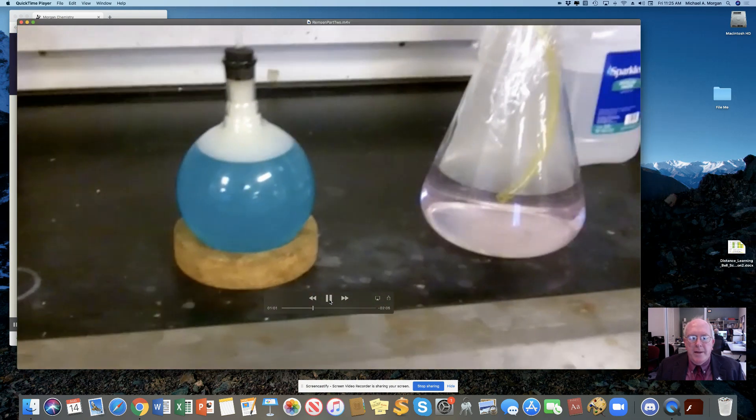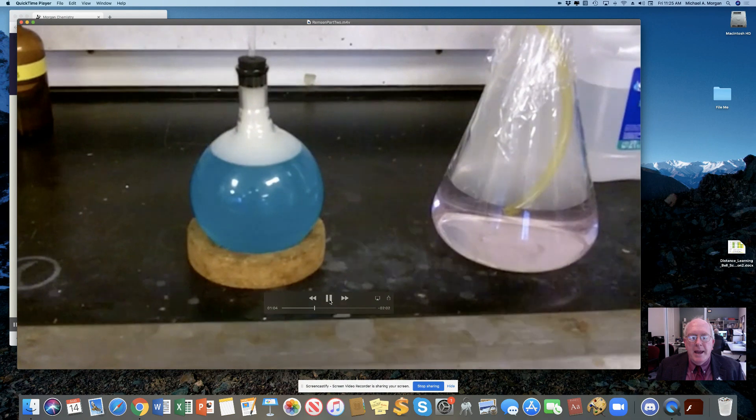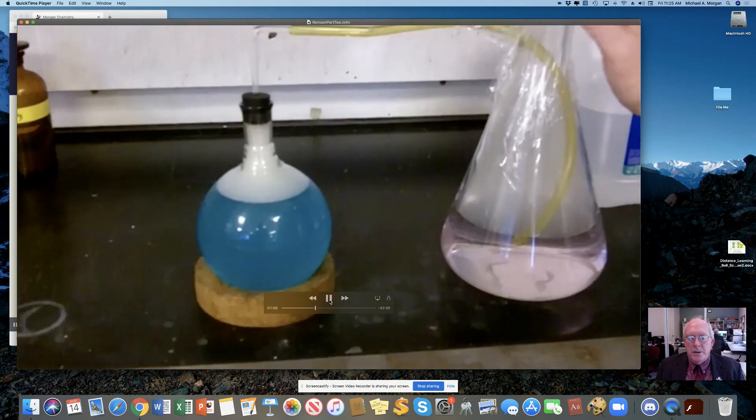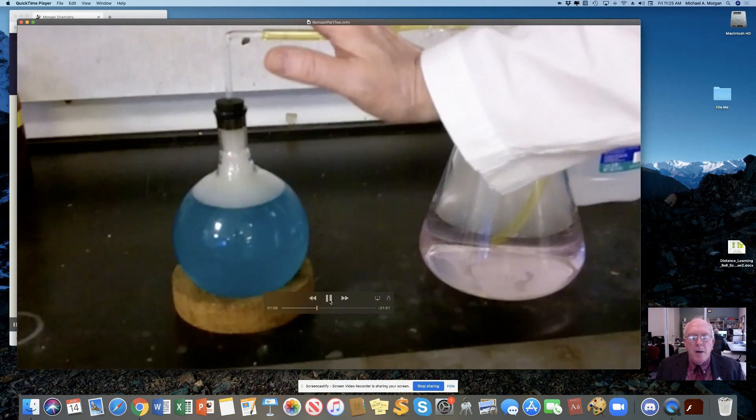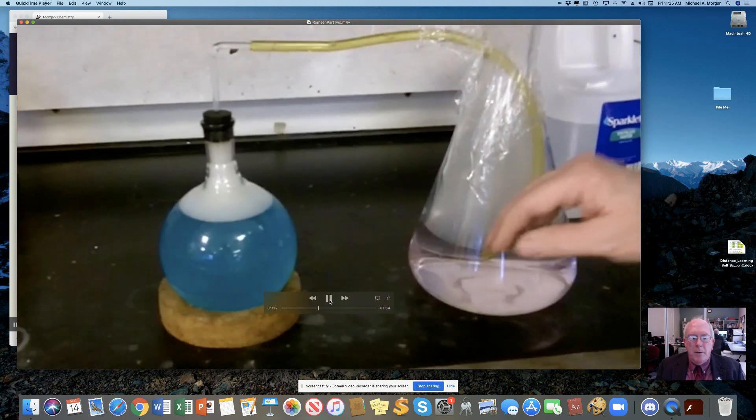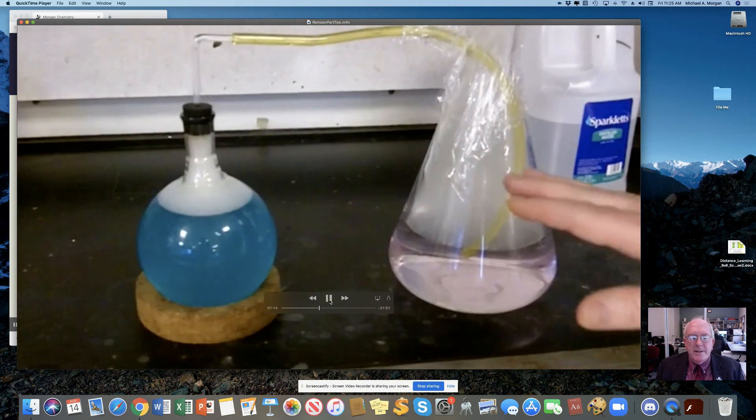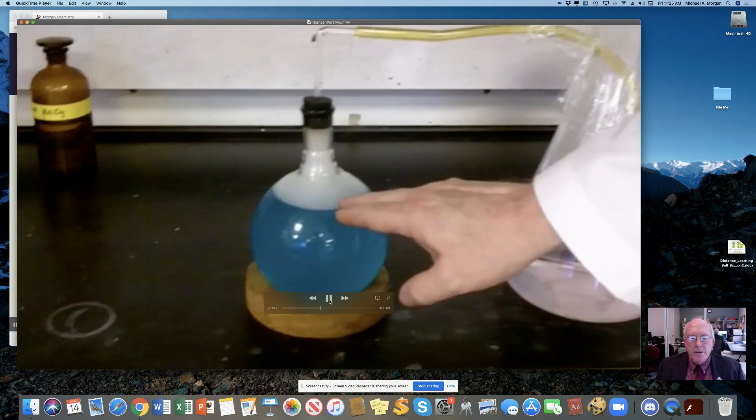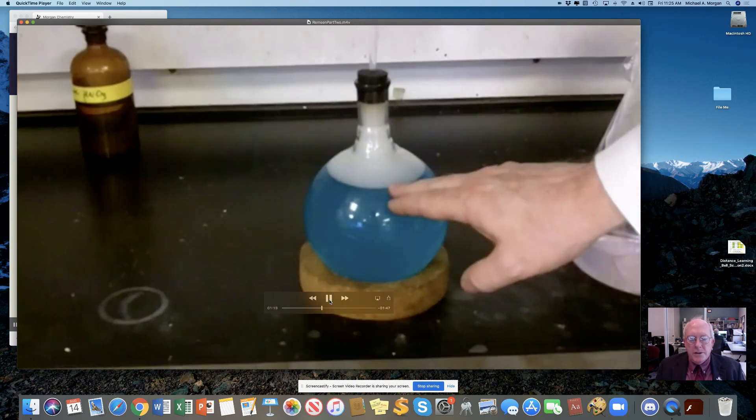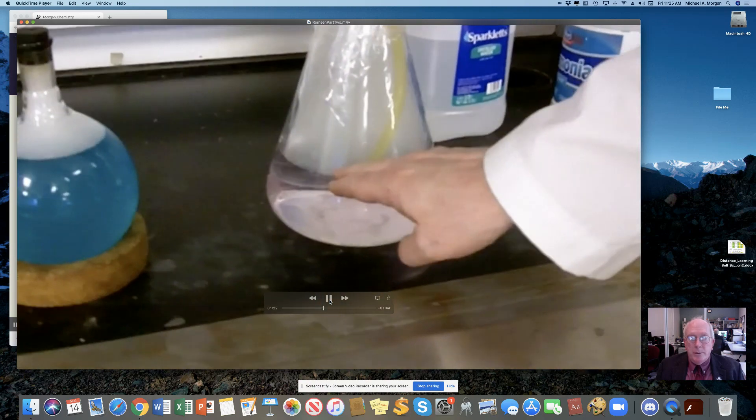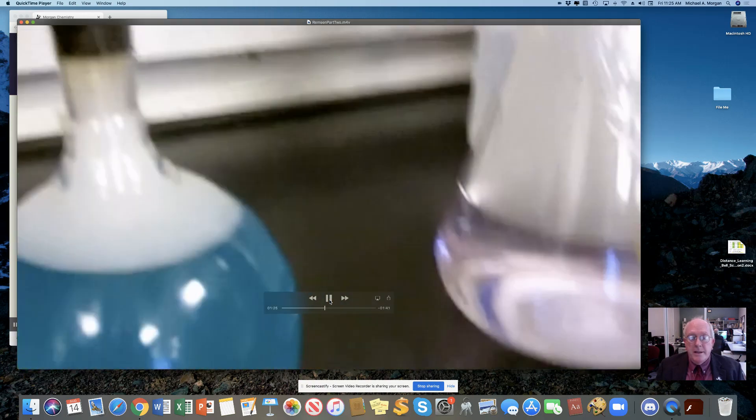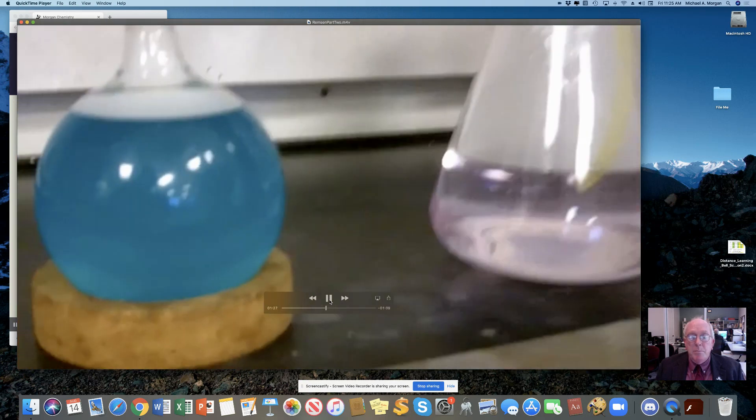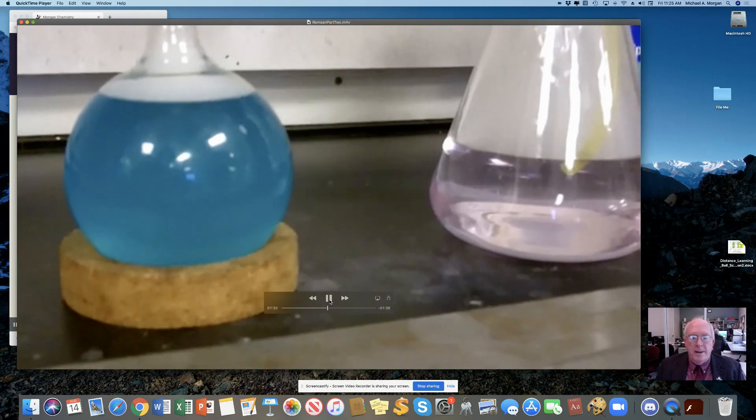Now, this is another spot where I would typically pause and have everybody draw a picture of what this looks like. Now, notice at the top of the round bottom flask, the liquid did not come all the way up. There's some gas in there that's preventing that from happening. And also notice that the liquid levels in the two flasks are not equal to each other. This was not just a siphon effect. This means that that liquid was pushed from the right side over to the left side.